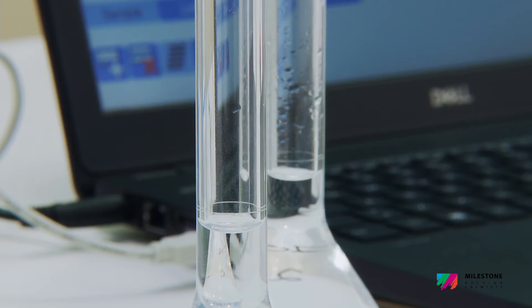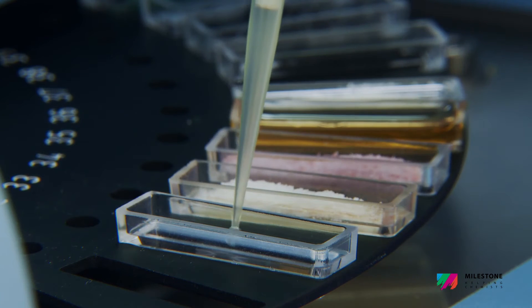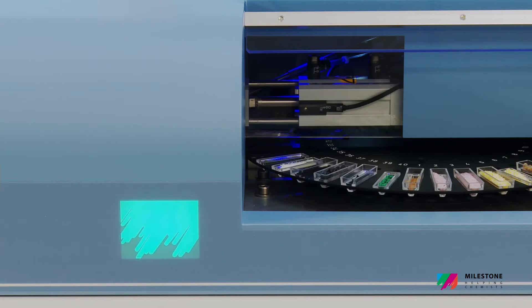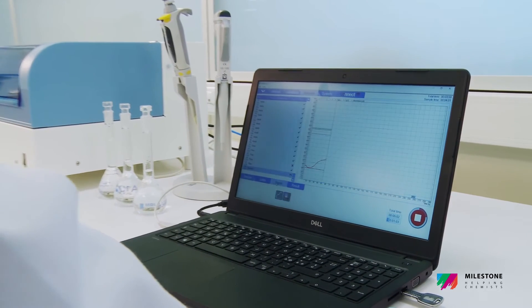The multiple cuvette cells and the double beam configuration ensure high stability, great reproducibility, and an unrivaled detection limit.